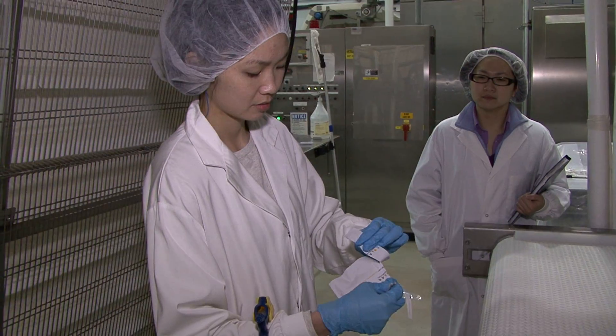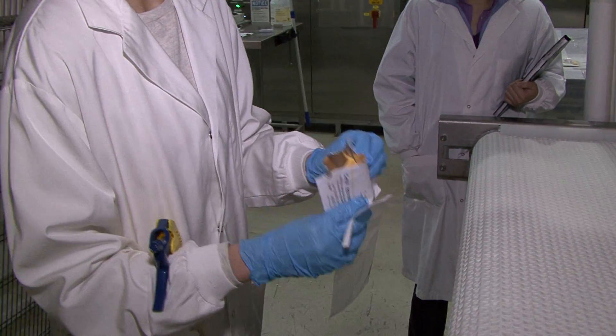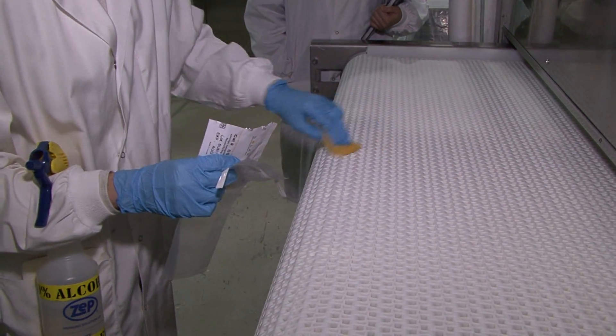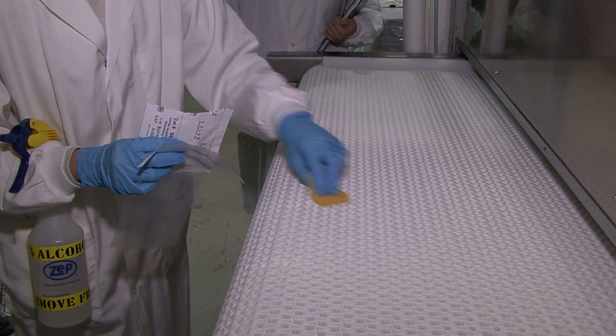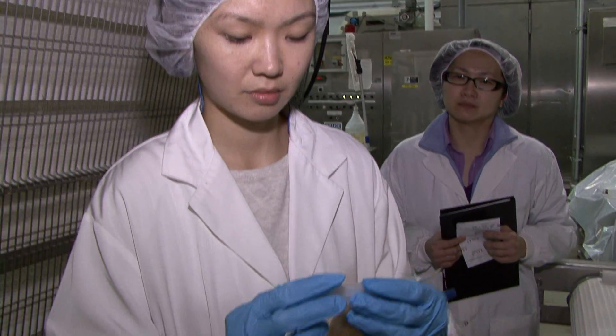You can also get sterile sponges to swab an area. They are usually used to determine if specific organisms are present. After swabbing, the sponge is placed in a sterile bag and sent to a testing laboratory, such as EXOVA, for extracting and culturing the microorganisms.